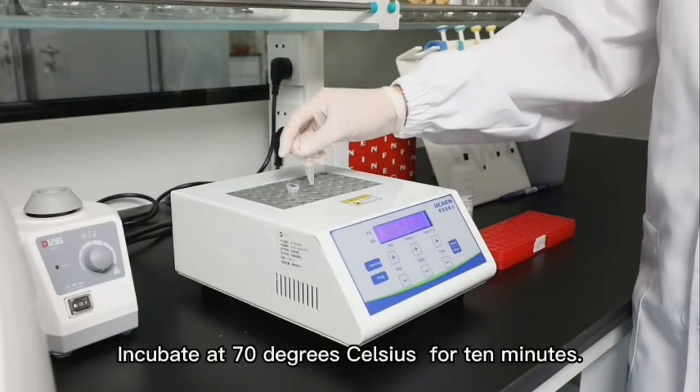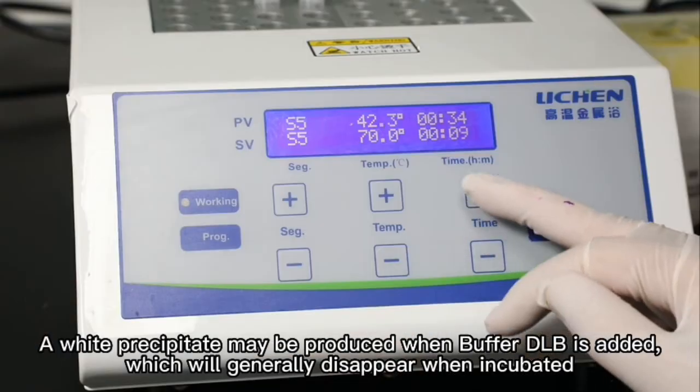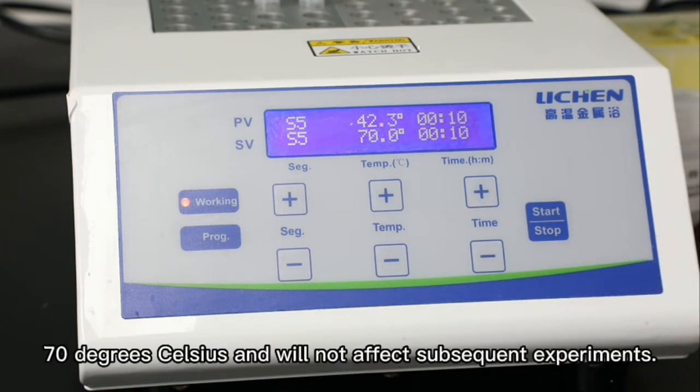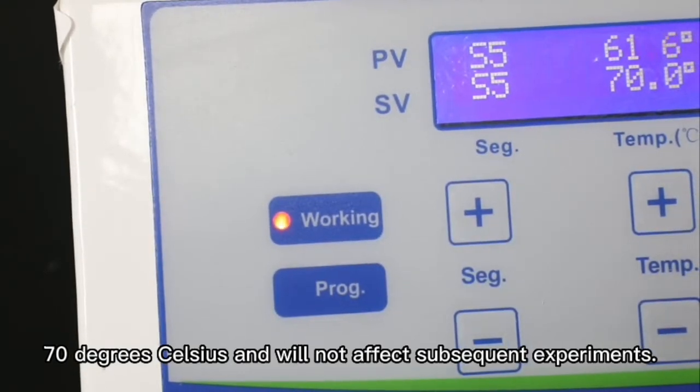Incubate at 70 degrees Celsius for 10 minutes. A white precipitate may be produced when buffer DLB is added, which will generally disappear when incubated at 70 degrees Celsius and will not affect subsequent experiments.